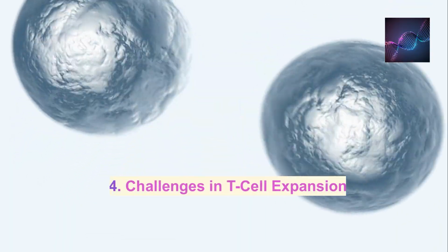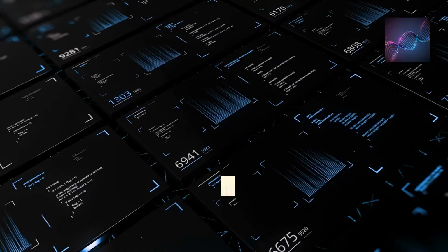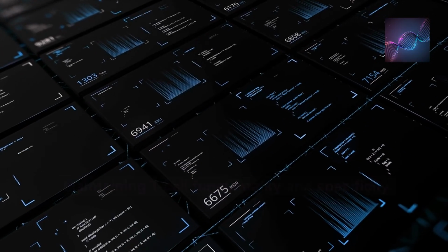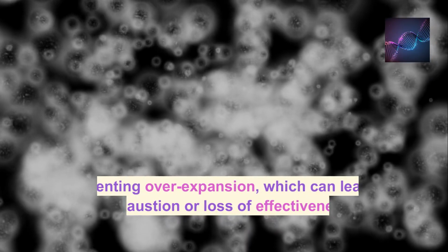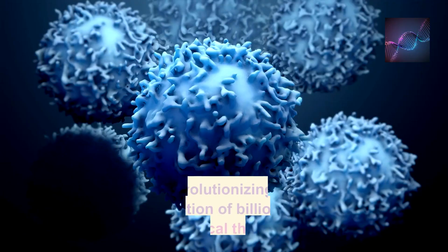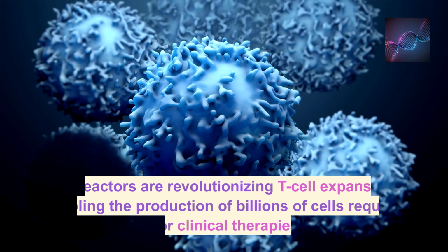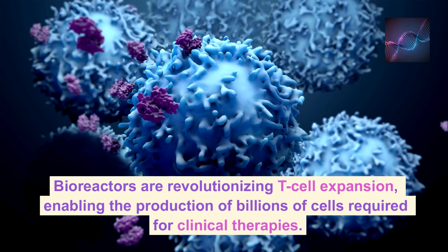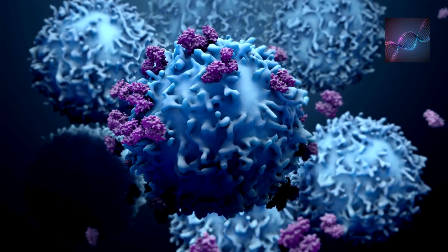4. Challenges in T-cell expansion. Maintaining T-cell functionality and specificity. Preventing overexpansion, which can lead to exhaustion or loss of effectiveness. Bioreactors are revolutionizing T-cell expansion, enabling the production of billions of cells required for clinical therapies.